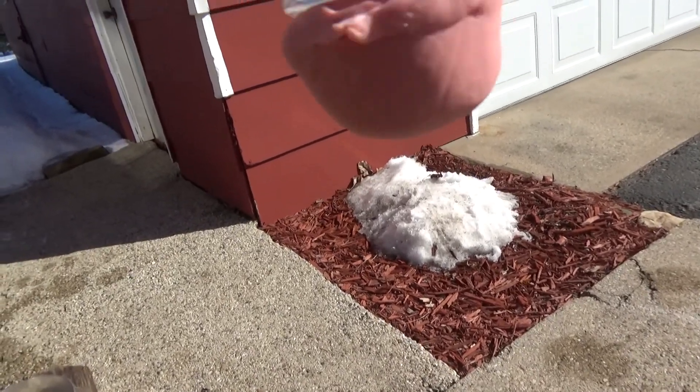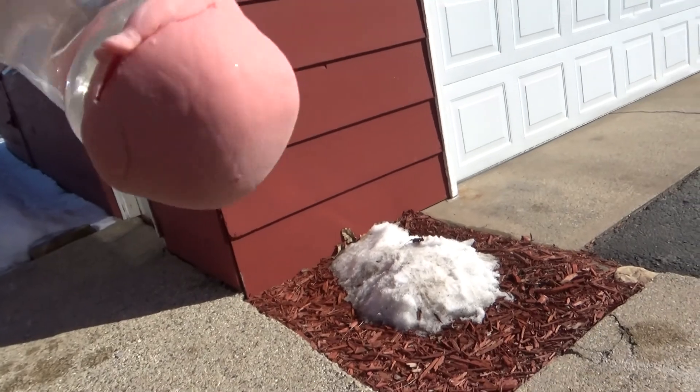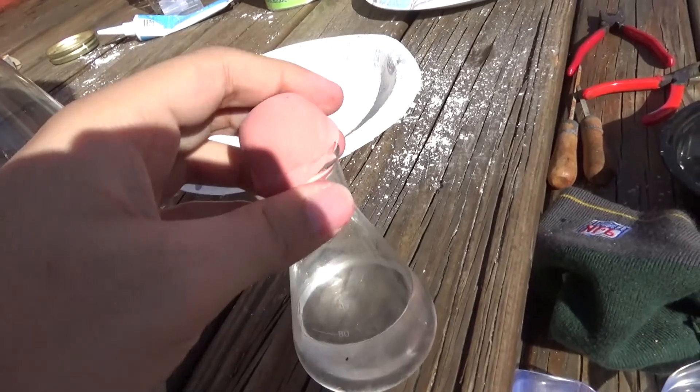It's actually holding — look at that, it's holding the water inside! So I guess that just shows you: even if it's not a perfect seal, it'll still hold pretty well.